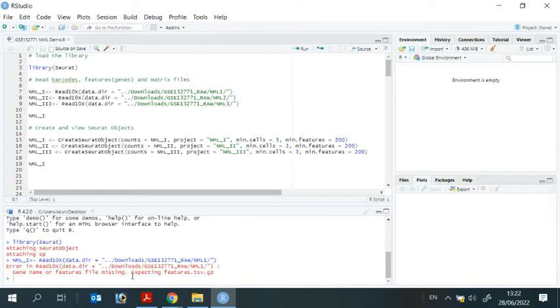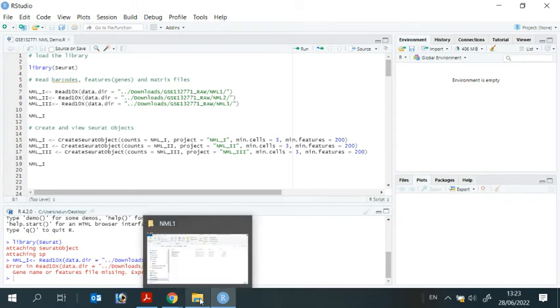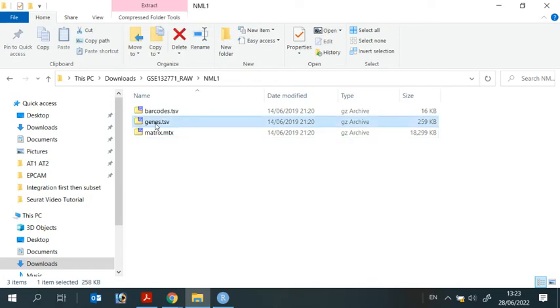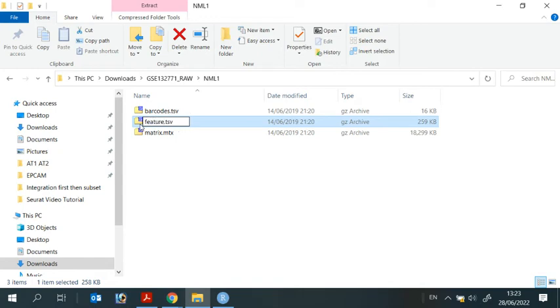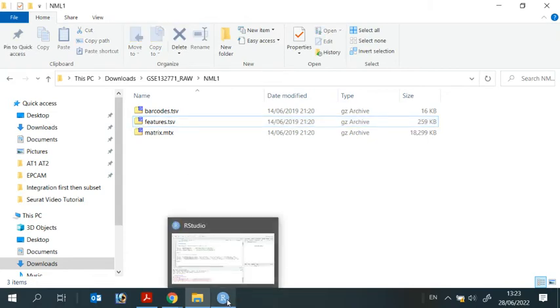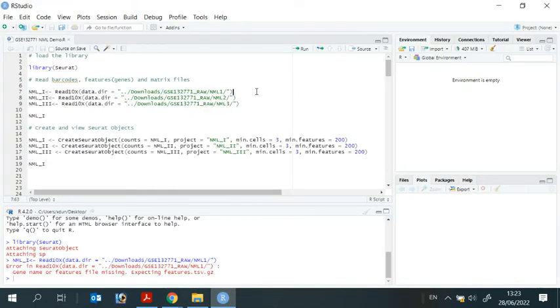The error says expecting features.tsv.gz. That's the file. We didn't change the name. We need to go back to nml1 and change the genes to features. I kept it here just for demonstration of how you can deal with errors in R.